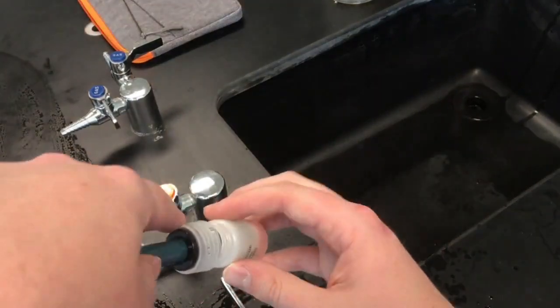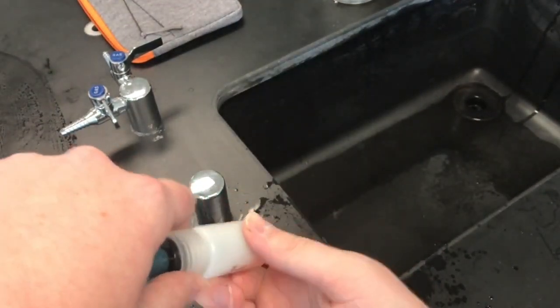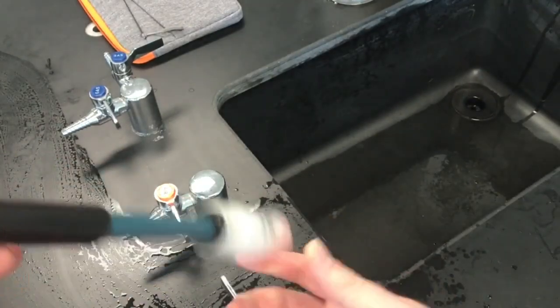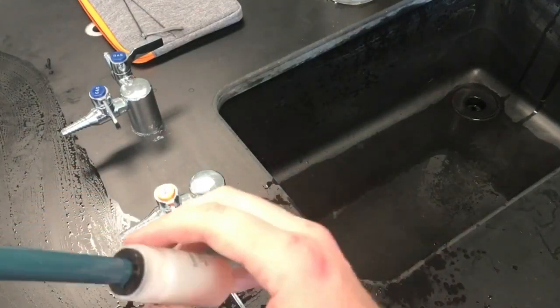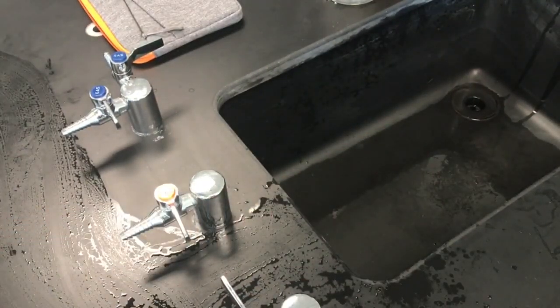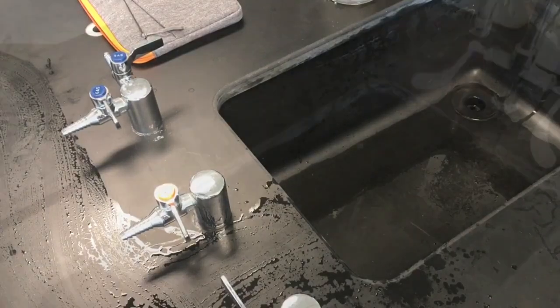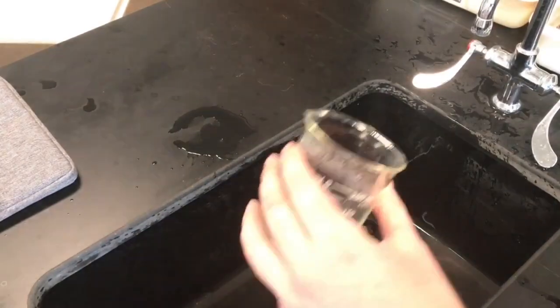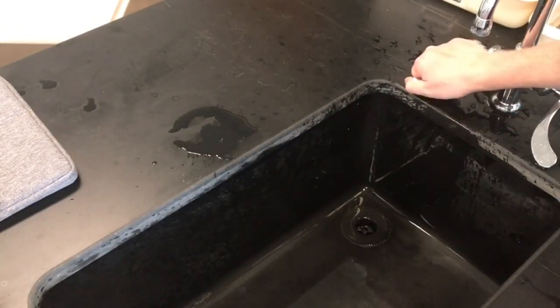And then I'm going to screw it back onto the storage solution here. So, cap should be on nice and tight. You don't want that to come out. And then we can put away our pH sensor and our LabQuest device. You're going to want to rinse off your glassware at least 5 times.